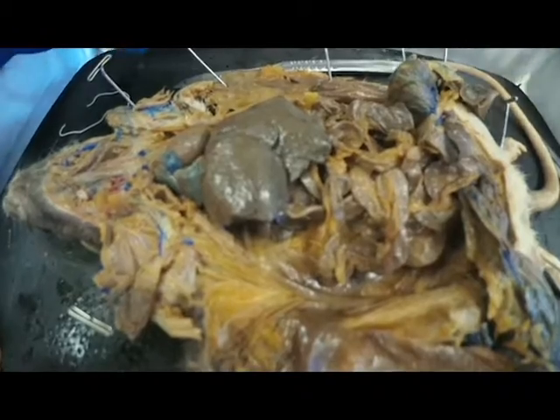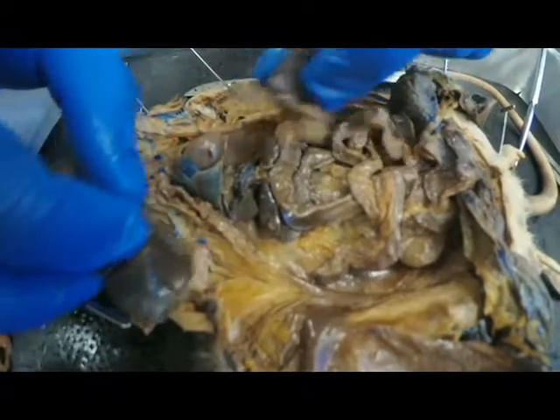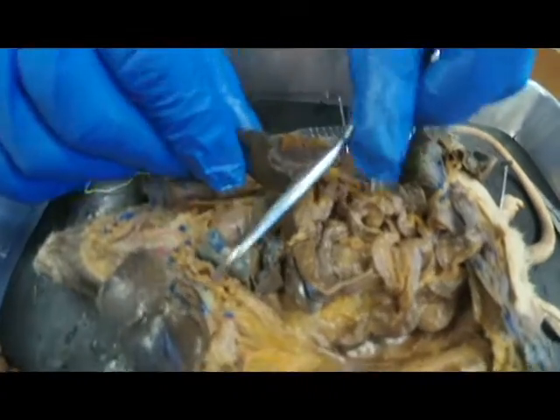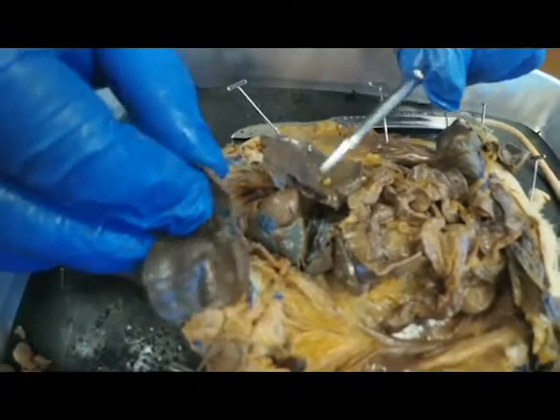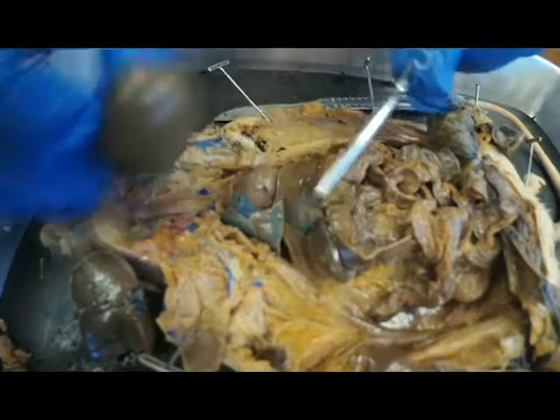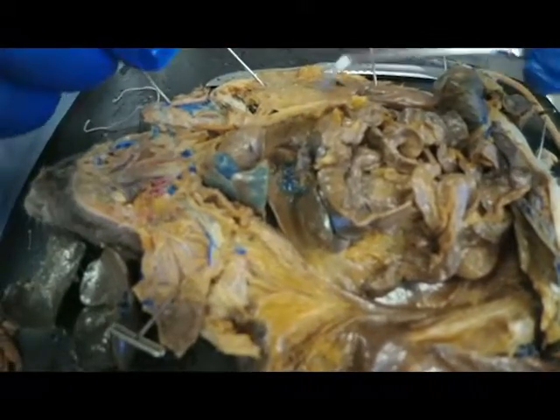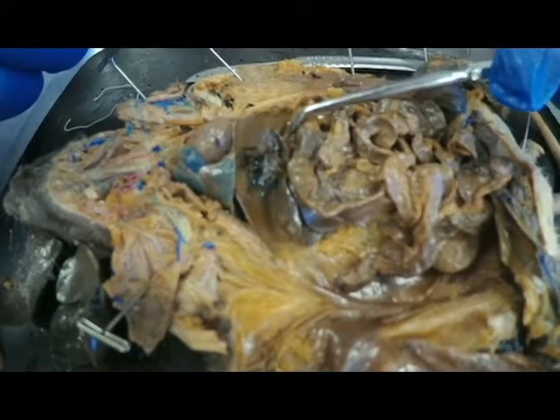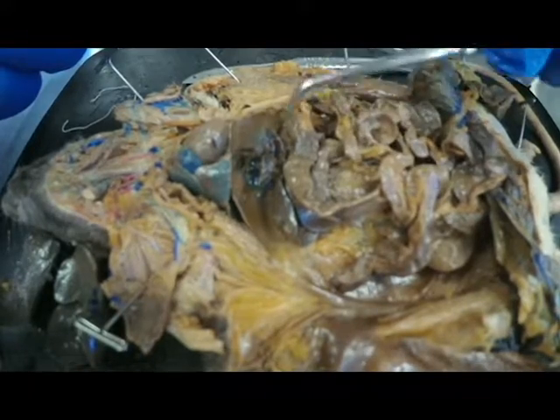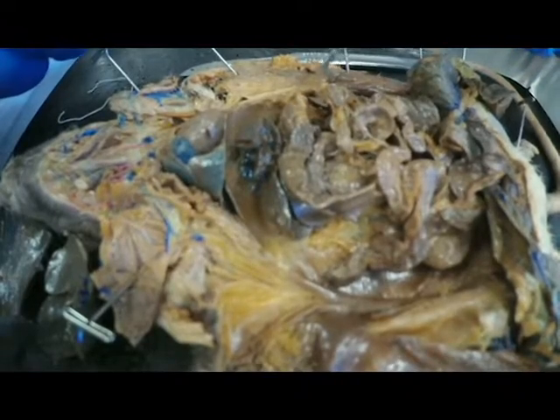These are the livers. As you can see, there's multiple lobes. We already cut them out to show you quicker. The liver has large veins and arteries coming in and out of it that connect directly to the heart. The liver is for secreting bile. Something unique about rats is that they do not have a gallbladder. The gallbladder is something that humans use to store their bile, but the rat does not have it. So the rat's bile goes directly from the liver into the bile duct, which goes to the duodenum.